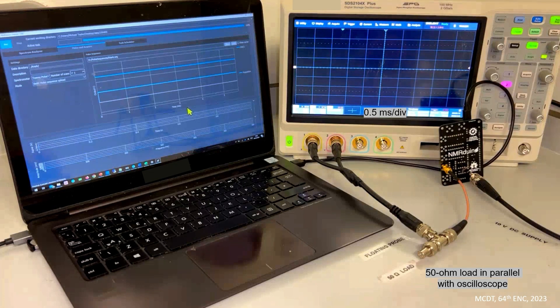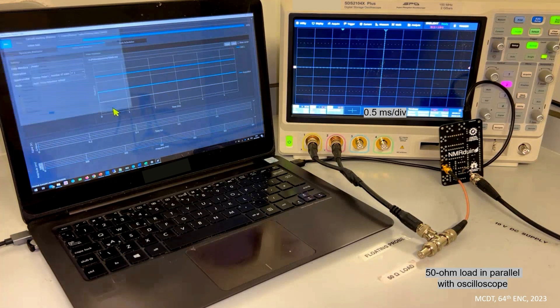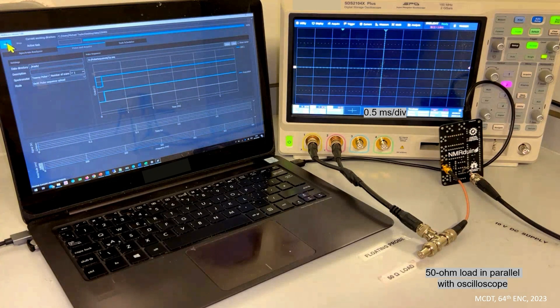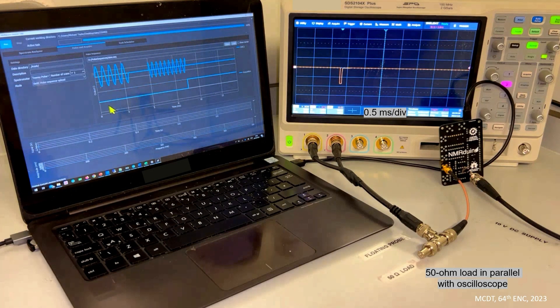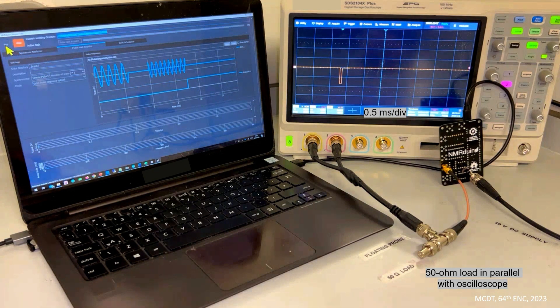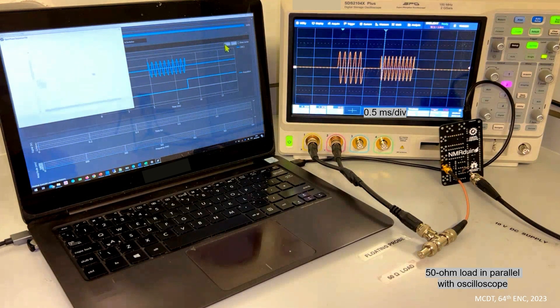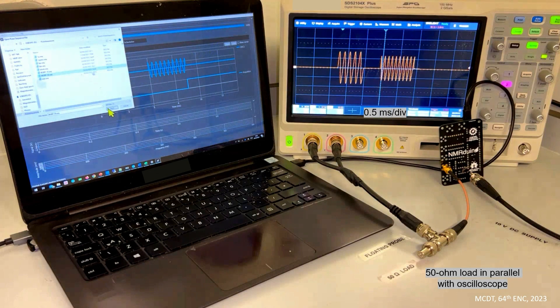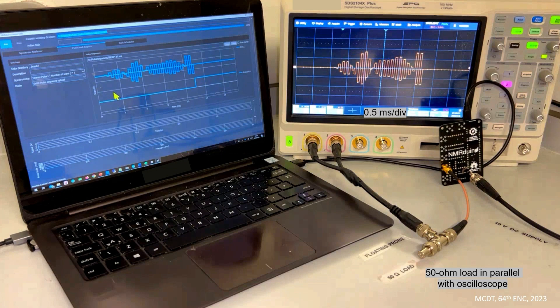In the demo video, a user interface allows clicking a pulse sequence and loading it in. A simple rectangular pulse is loaded, run is clicked, and it's shown on the oscilloscope. A couple more are loaded — one is a sine wave for RF-type pulses. The entire experiment is just the NMR Arduino board connected to the laptop, with the output connected to the oscilloscope, and more interesting profiles can be generated.